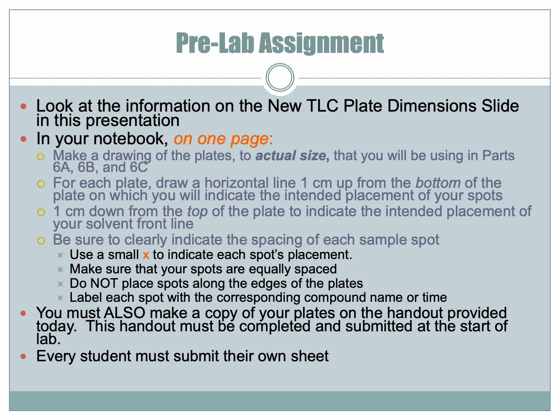Be sure to clearly indicate the spacing of each sample. Use a small X to indicate each spot's placement. Make sure your spots are equally spaced. Do not place spots along the edges of the plates. Label each spot with a corresponding compound name or time. You must also make a copy of the plates on the handout.